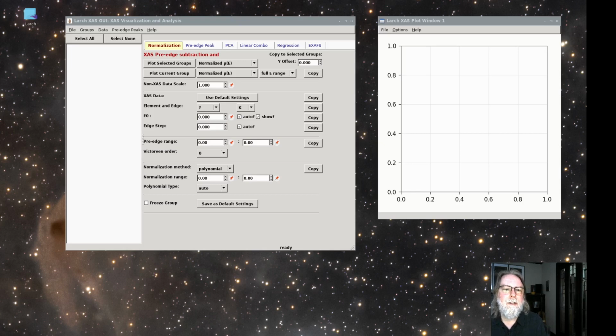Linear combination also relies on the fact that a sample with a mixture of these environments, say octahedral oxygen and sulfide, will have a spectrum that is a simple linear mixture of those two basic spectra, and that the atomic environments and spectra won't mix or interact in a more complex way. Together, this all points to the idea that there is not a complete continuum of molecular structures that make up any real spectrum, but a small number of idealized and discrete basis spectra.